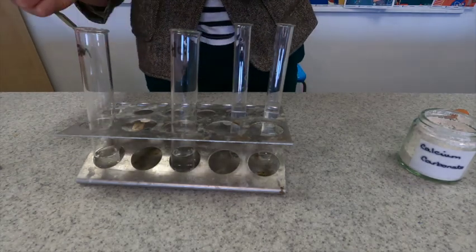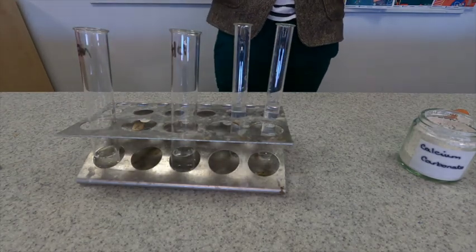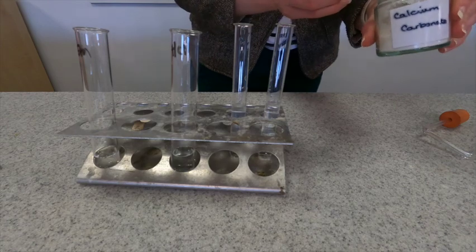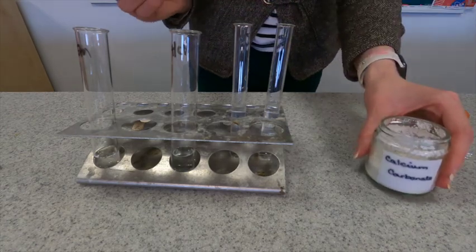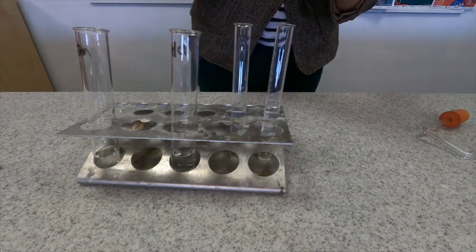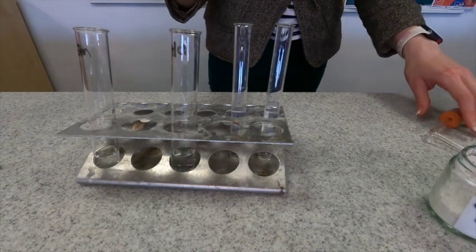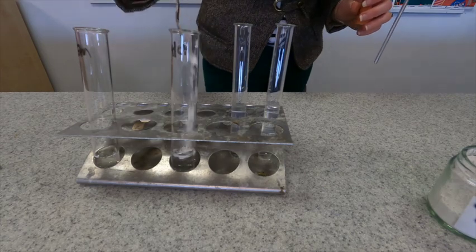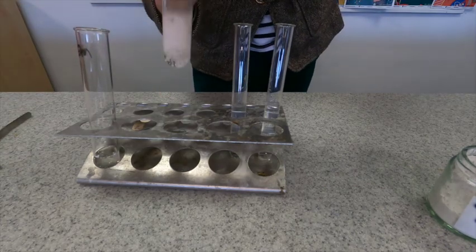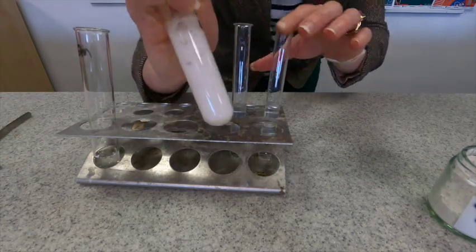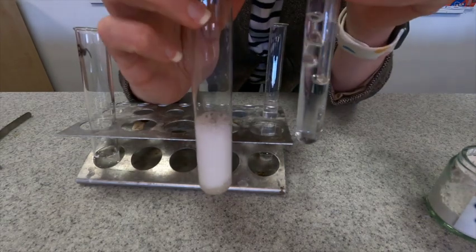Again to start us off I'm going to do hydrochloric acid. We'll have a look at the observations in the tube and also what happens with the lime water. So I'm just trying to get a spatula full in. I'm going to have to be very, very quick with this so you can see it fizzing straight away. Lots of fizzing. Let's get it into the lime water.